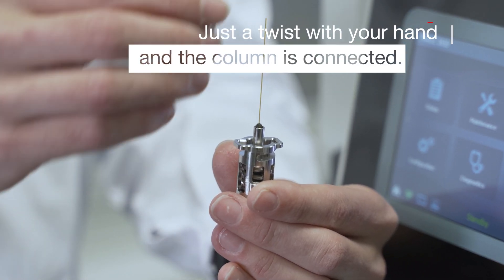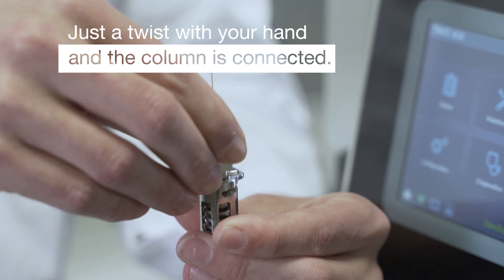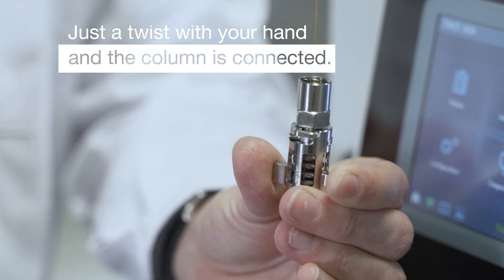All you have to do now is first place your ferrule on the column, and then inside the GC oven it's just a twist of the hand to connect your column to the GC. It just makes switching them so much easier and so much faster.